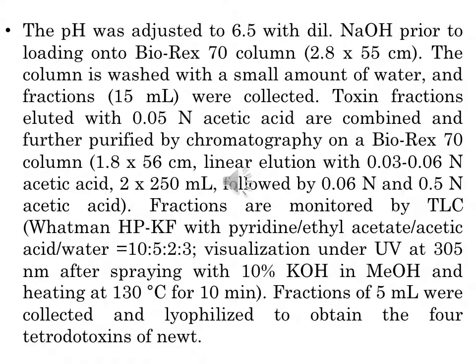Desalting is probably the most important step in the handling of water-soluble compounds. It is not necessarily difficult to fractionate the water-soluble compounds to a single chromatographic peak. In fact, strongly hydrophilic compounds are routinely analyzed on high-performance liquid chromatography, that is the HPLC, without any trouble. However, what makes the preparative separation of water-soluble compounds so difficult is the separation of inorganic salts, often from minute amounts of the target molecules.